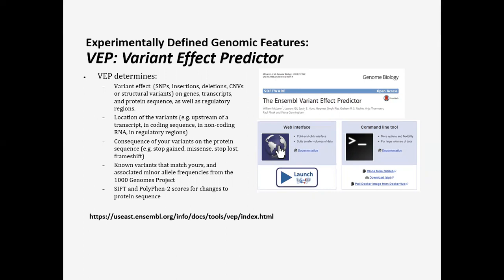Yeah. So sometimes, there are two conditions. One is known, one is unknown. Suppose in BRCA1, BRCA2 also, there are some known variants. When you are working with parental samples, you know what is present in the parents and what is present in your proband. That is how it works. But suppose you take the condition where you do not know the parental status, what will you do? There are again different conditions. You can create so many conditions: you know the genes, you do not know the genes; you know the variants, you do not know the variants. When we know something, it is very easy to evaluate. When we do not know anything, then what? It goes like that.